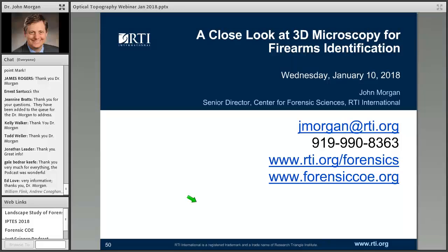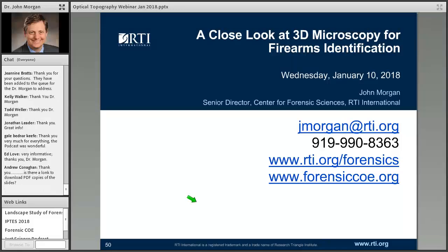All right, we've got two left that we can handle for today, then we're going to have to wrap things up. Rachel Bolton King is asking which systems can currently export ballistics data in the X3P format? I think most of them can. The landscape study table actually has a particular row looking at X3P. So I suggest you refer to that to make sure you get good data, as opposed to me telling you off the top of my head.